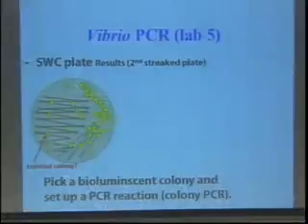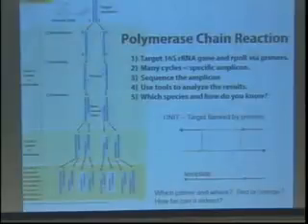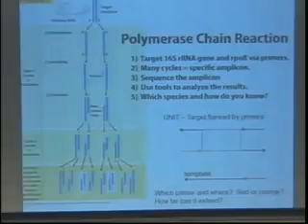So anyway, what we're going to do is pick that colony, isolate it, and do the PCR. So basically, remember, we have a target sequence. In our case, 2 specific genes: the 16S ribosomal RNA gene, and another gene called RNA polymerase B. Keep in mind that for our purposes, we have that large bacterial chromosome, and our target is a very small percentage of that.